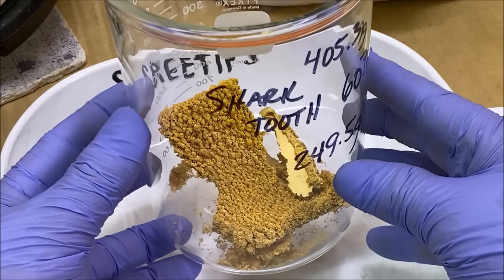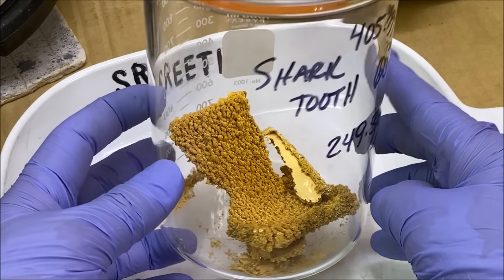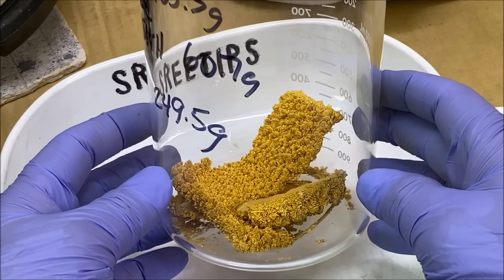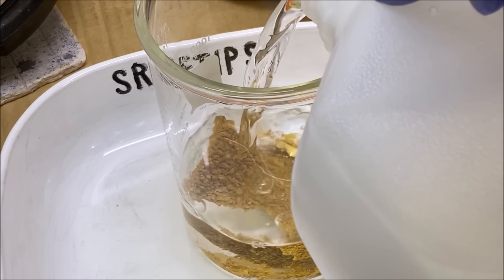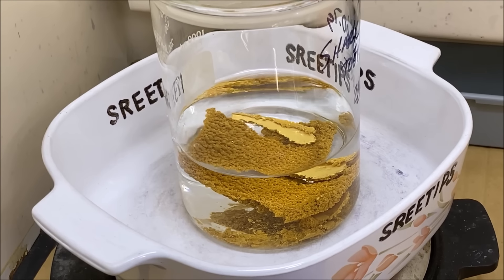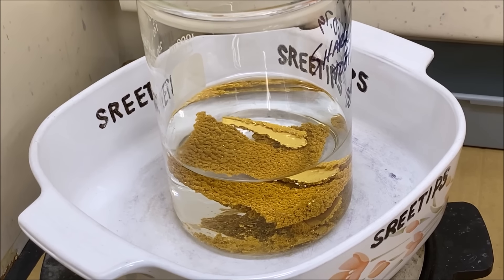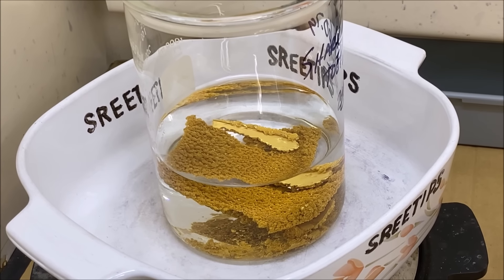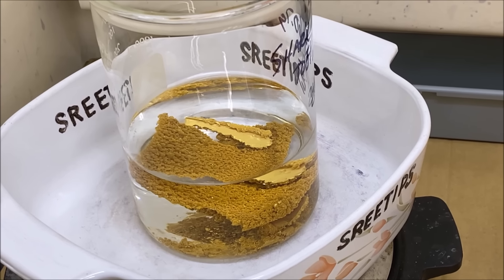We're going to offer some of this for sale on my eBay site at $140 per gram. Don't squawk at me about the price — I really don't want to sell it. The longer I hold this the more valuable it will become. What we're going to do now is just boil this in some distilled water to get all the excess chloroauric acid solution off of there, and then we'll dry it off and offer a few pieces for sale just like they are.